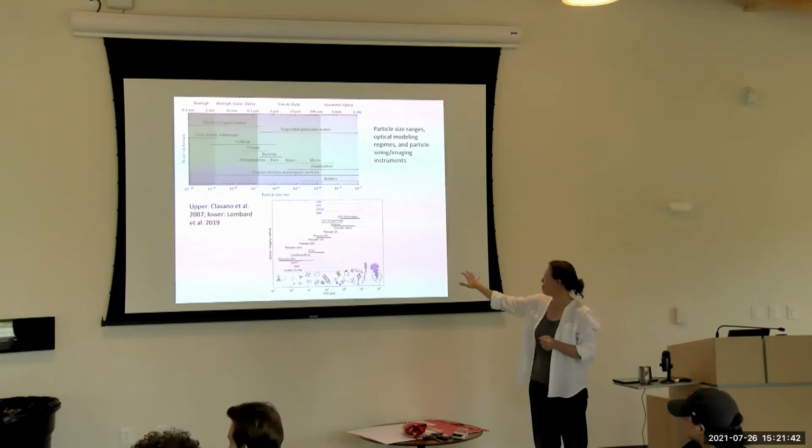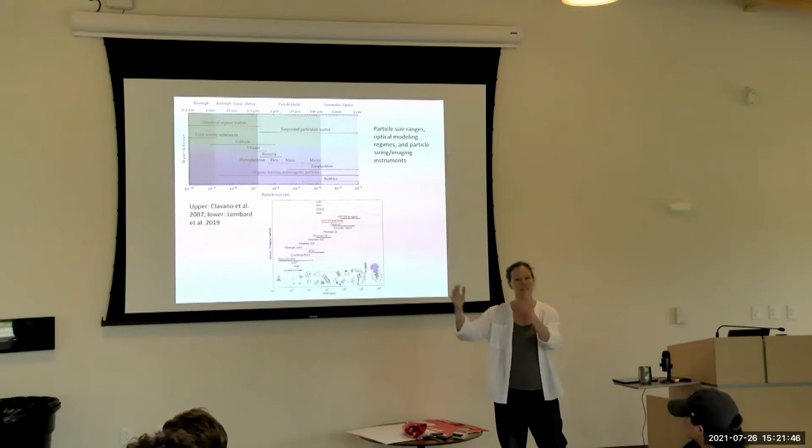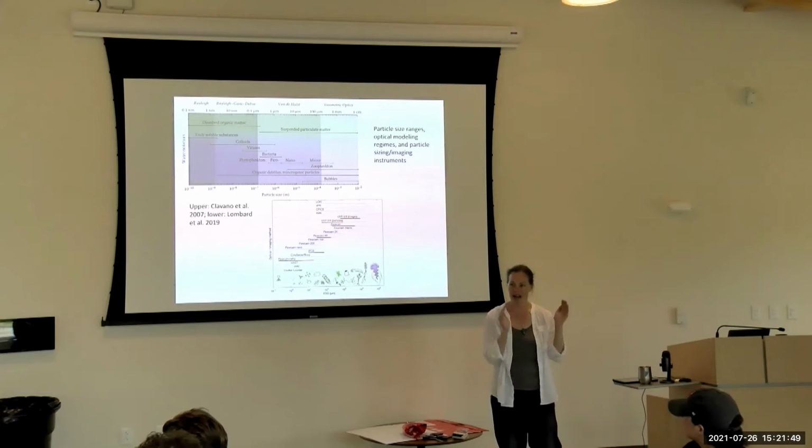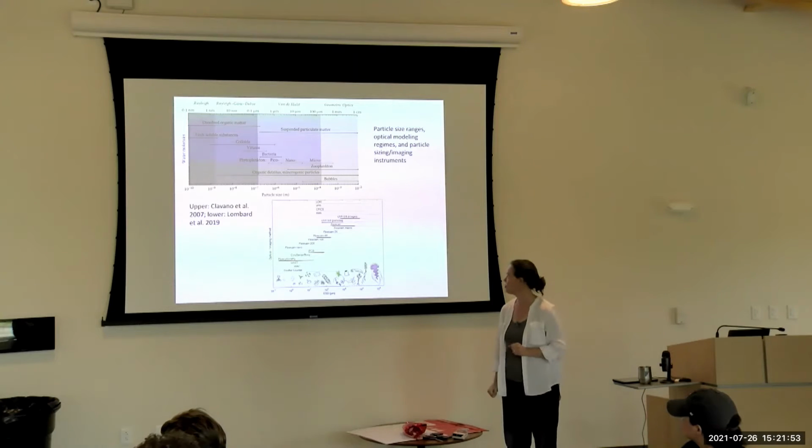Anyway, just sort of overlapping those imaging systems. So we can see we've got a lot of different systems that are out there. They all have these limits in terms of what they can detect and what types of particles they're sensitive to.